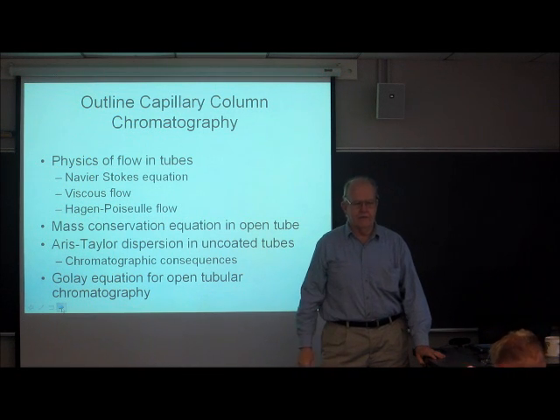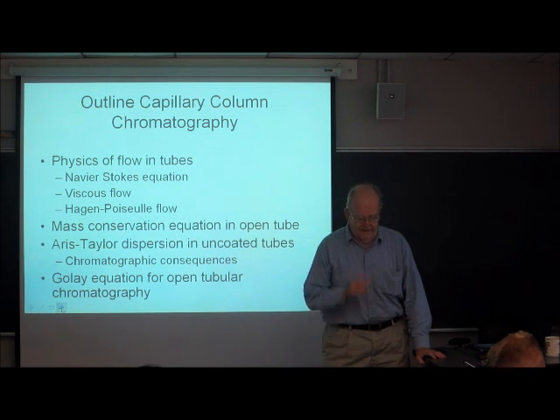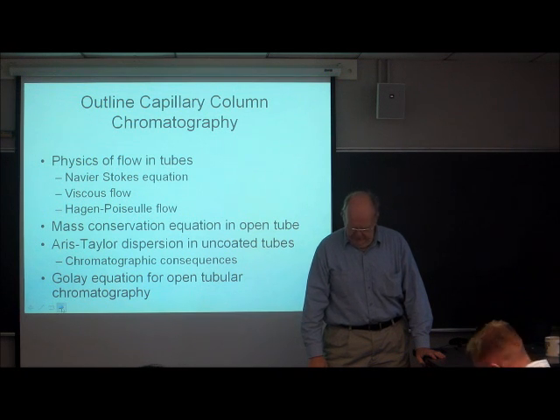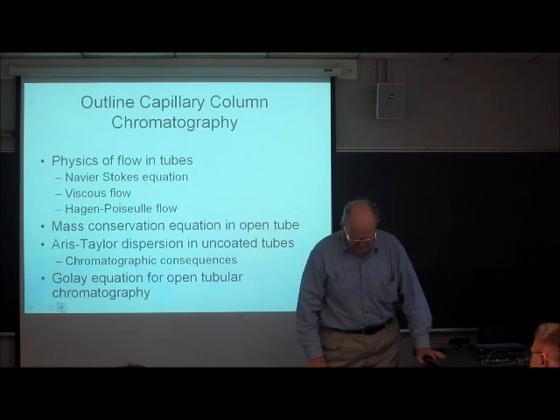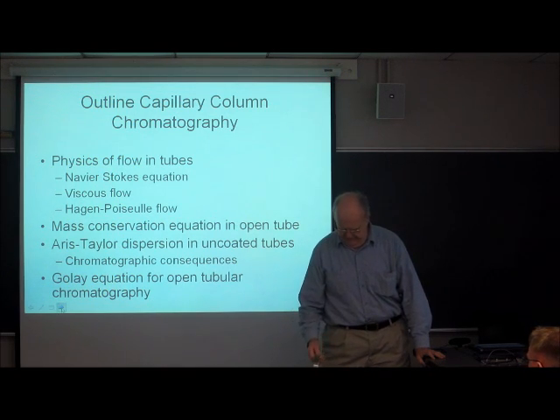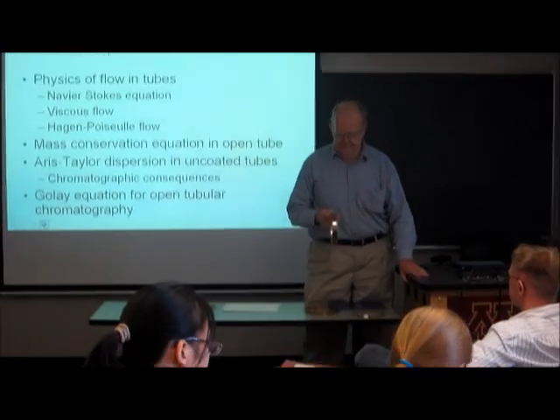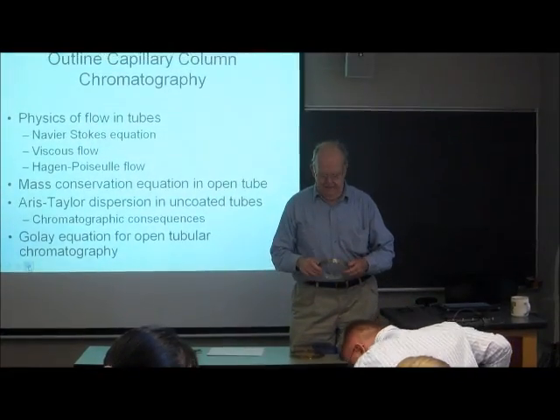That's the way gas chromatography started, with that type of column. That happens to be a 6-foot long column. The ID of the column, I believe, is 1/16 of an inch. The OD is 1/8 of an inch. About 1957 or so, M.J.E. Golay invented the capillary column.